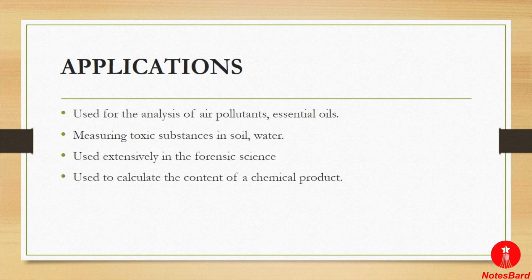Besides this, there are several advantages, like it favors non-polar molecules also, and it is typically used in applications where small and volatile molecules are detected, but it is not applicable for large molecular weight molecules. Besides all the advantages, there are some limitations for this method, like the samples are required to be salt free.